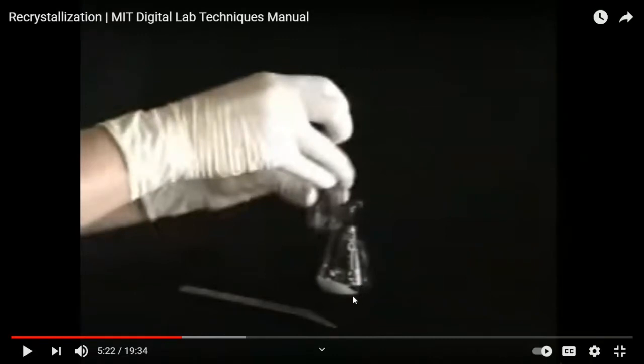So you have to remember these details. People who know this technique will understand why. That's why you need to remember this. The 5 steps are simple. Now you see the details. You are doing the second step, dissolving things. Dissolving doesn't take place at room temperature, so you have to set up the hot plate and boiling water bath. Then before you actually dissolve, you have to save a little. Not many people save a sample at the practical test. Then there goes deduction. If you actually know the technique, you have to save it.